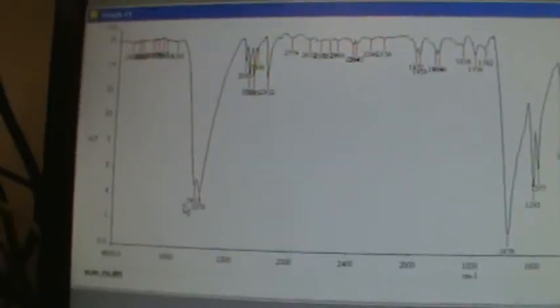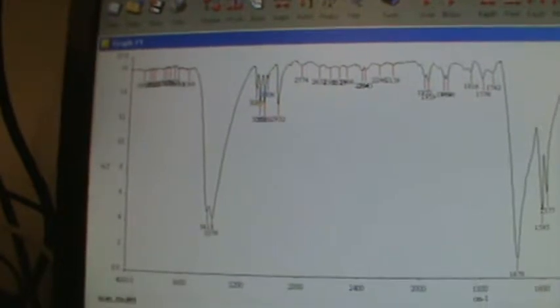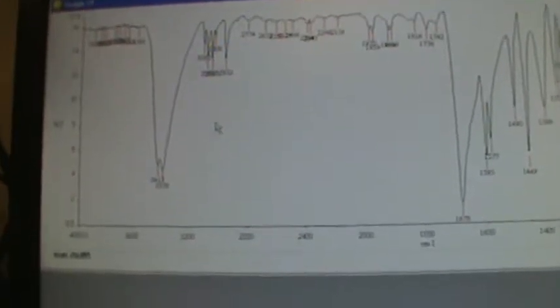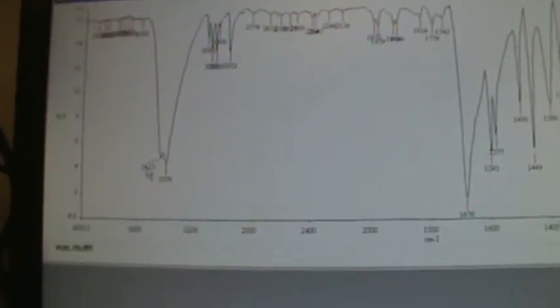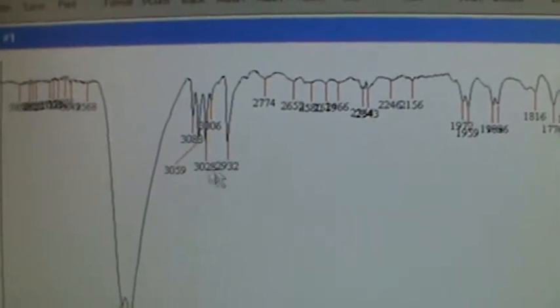So if you're really desperate to get that last peak, you could always just play with the manual one, because it's easier. On this one, I gotta be honest, I honestly don't know how to do it. Never been an issue to try it. I'm not really worried about extra peaks if that's what it is. And you can actually take this, move it over so that you can see it better. So once you have all the peaks that you wish, okay, you can tidy up some of the peaks that might be overlapped a little bit. So you can click on some of these, drag them over, right? So that you can see the numbers.